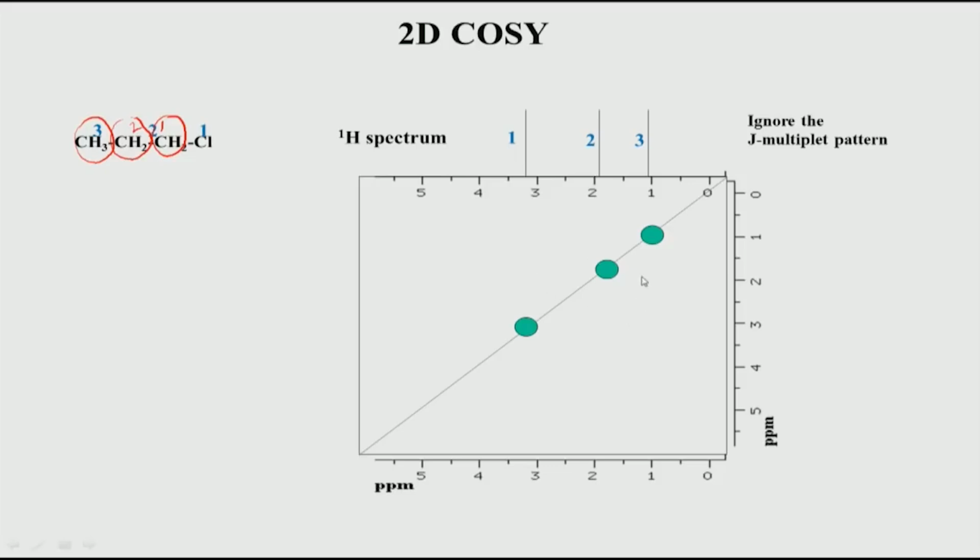So, we will see now the cross peak. First let us see between 1 and 2. As expected, between 1 and 2 I would get a cross peak. That means, if you draw a line like this from here to here and here to here, these two green atoms are 1 and 2, and common to 1 and 2 there is a connection, a correlation between 1 and 2, which is reflected, or shown, in this red spot here.